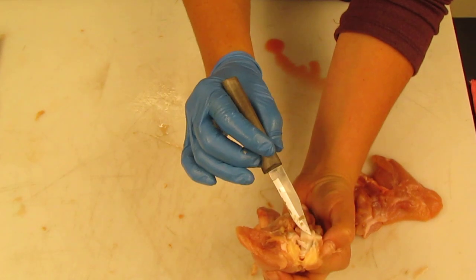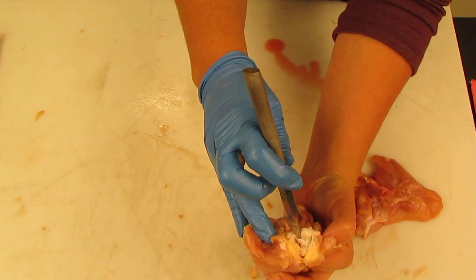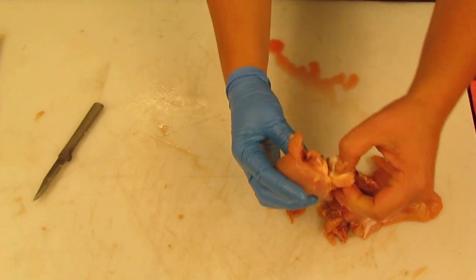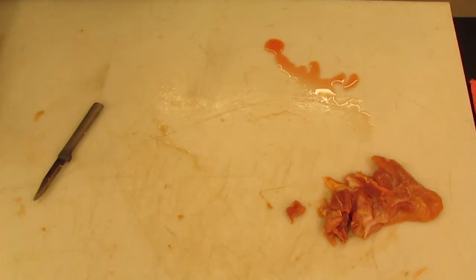All right, so again, the femur and the tibia. This little guy is the meniscus, and this little diagonal stripe of white inside is the ACL, the anterior cruciate ligament. Femur, tibia, meniscus, ACL, or anterior cruciate ligament. Also, I've pulled this out of the way, sliding all around. This is the patella, the kneecap, which I've pulled out of the way so we can see inside the joint.